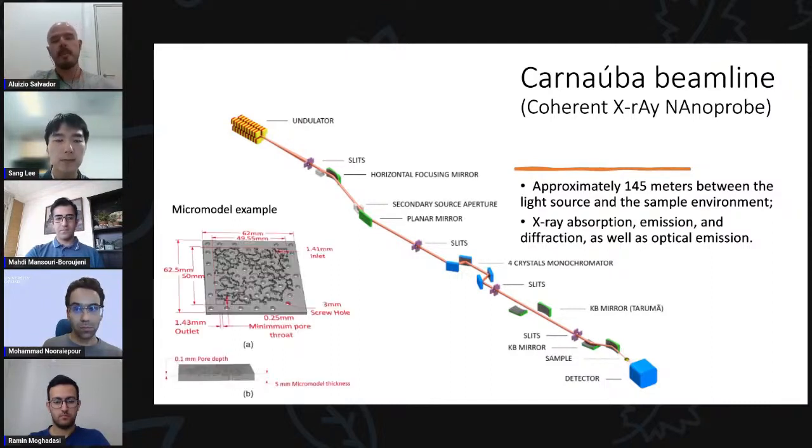As an example, microfluidic devices have also been applied to understand and study porous media. Here is a pore structure that tends to mimic the subsurface of a rock. However, these micromodels have an inherent problem. The engineered materials used to print this model, like silicon, glass, or PDMS, do not fully represent the chemical reactivity of rocks during an experiment.